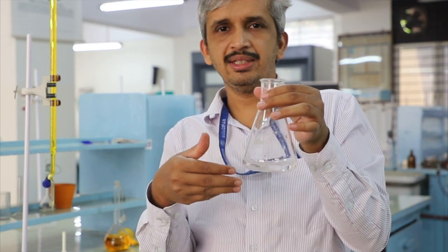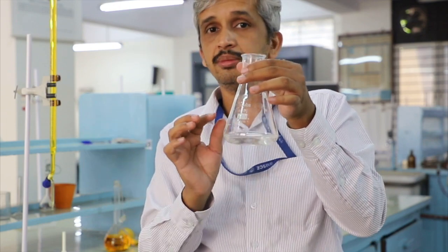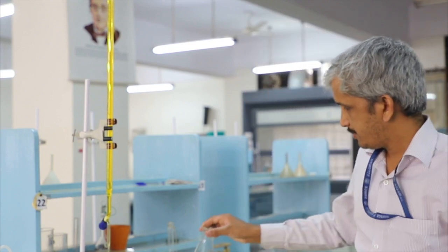What happens if I rinse the conical flask with the solution to be taken? There will be some portion of the solution left. If I rinse with the solution to be taken, you can see there are some droplets, right? Here you can see some droplets. That means some extra solution is getting added into the conical flask. Therefore, to avoid that, the conical flask should never be rinsed with the solution. It should be rinsed only with distilled water, not with the solution to be taken. Okay?